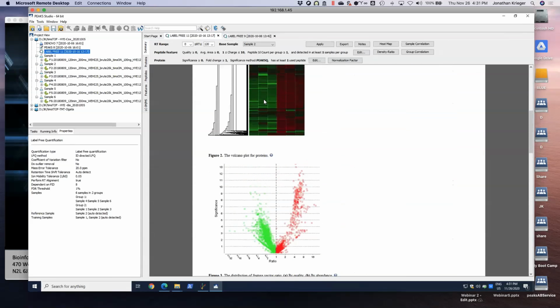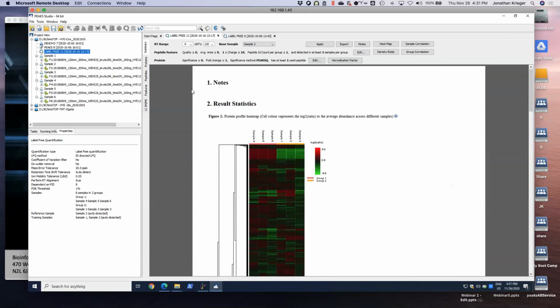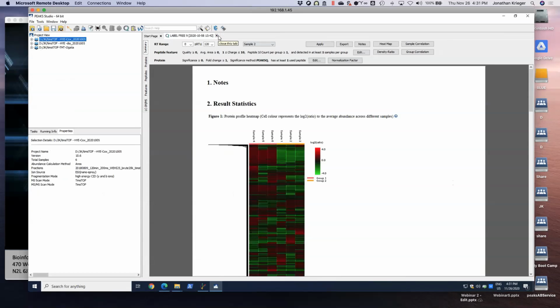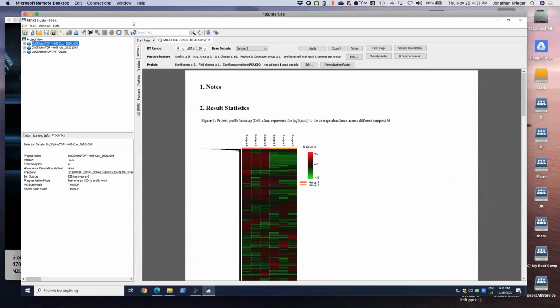But what about DIA data, and how does this translate into DIA? So I'm actually going to close this just to keep things from slowing down too much. What we did was we created a library that the Bruker Demo Labs was kind enough to run for us, and these were E. coli, yeast, and human separate runs that were fractionated into 6 fractions, where we did a deep dive and a quantification, and built a library based on that.